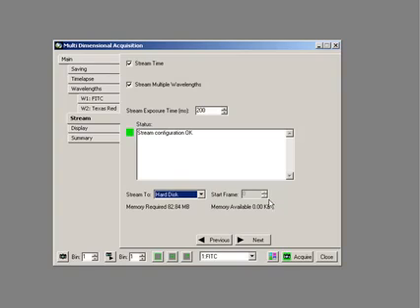If we go to hard disk, that again is true because we're now acting as if we're a video recorder, so it actually takes a little bit more memory to do that. But a decent computer nowadays on Windows 32 or 64-bit will be able to handle that for a large period of times.